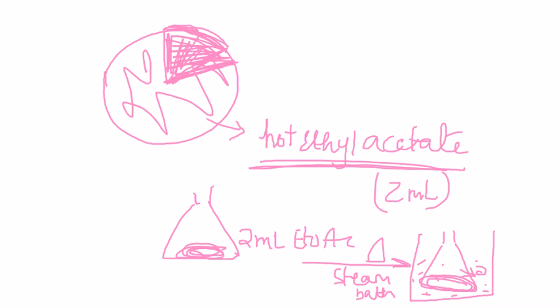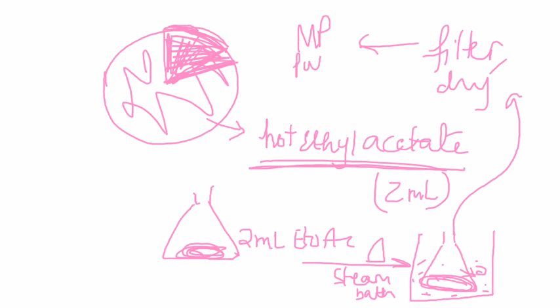And you are going to then collect this newly crystallized product. You're going to collect that in a Buchner funnel. By the way, before I go to the next thing, if you don't see that, you might have to add a couple drops or a couple milliliters of cold petroleum ether to aid the crystallization process. Any waste will go in the waste container, of course, and what you collect now is going to be pure after filtration. Filter and dry.